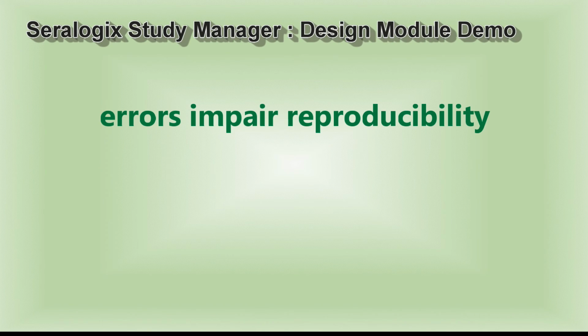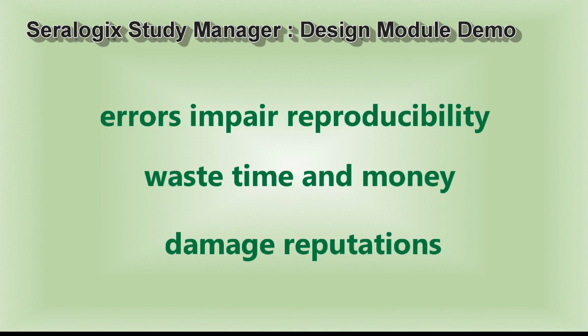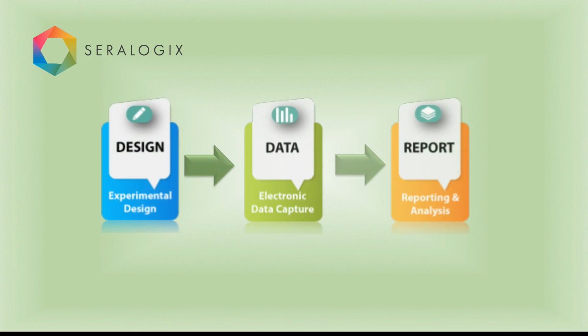Preclinical studies are a major undertaking and carry considerable risk of errors that impair reproducibility of study results, wasting time and money, and potentially even damaging reputations. Use of the Seralogix Study Manager significantly reduces the chance of these painful errors, while simultaneously making studies smoother and easier to design and manage.